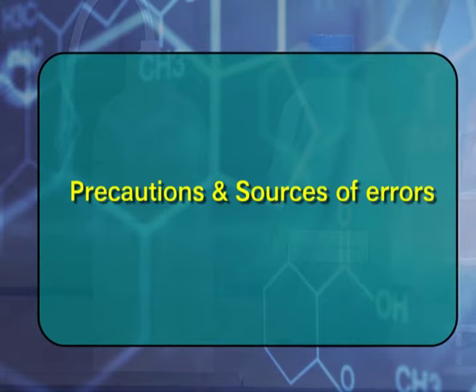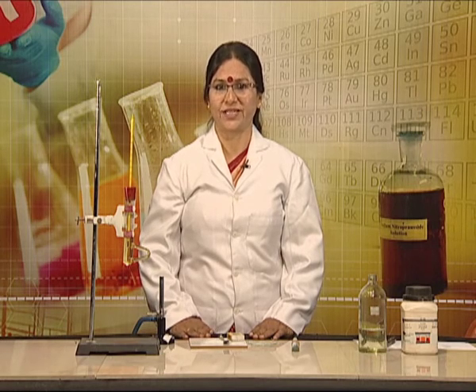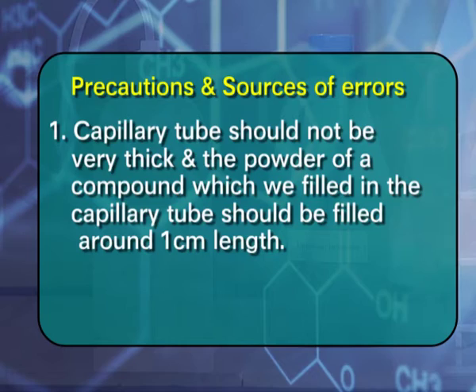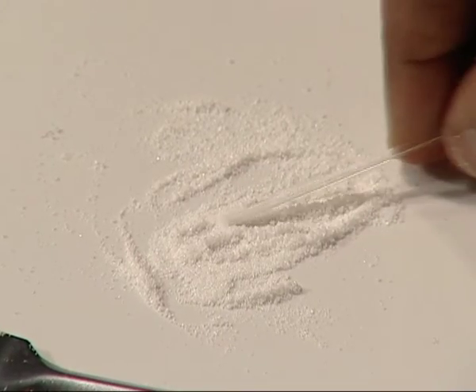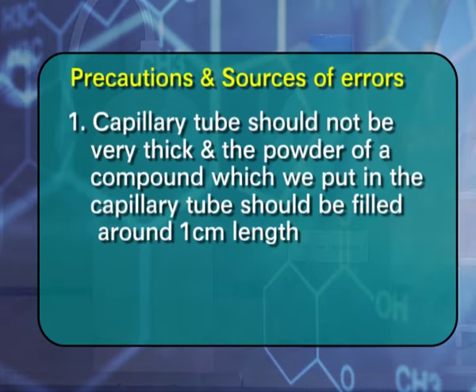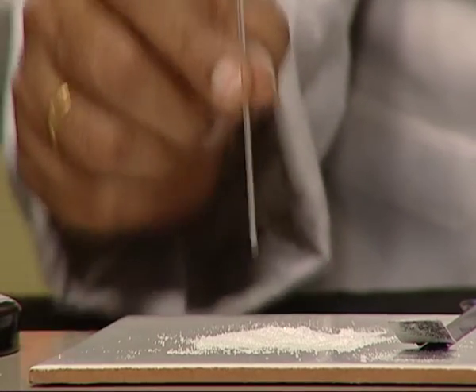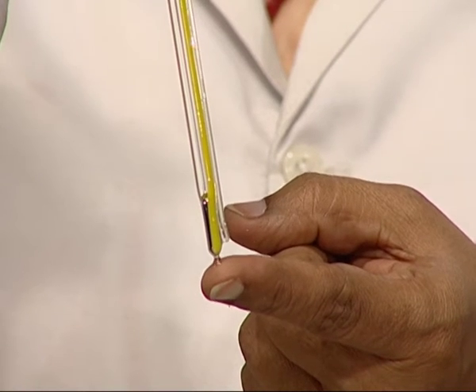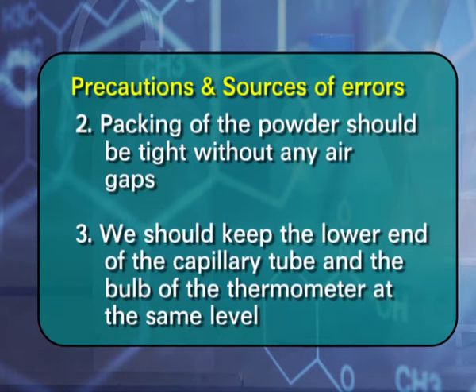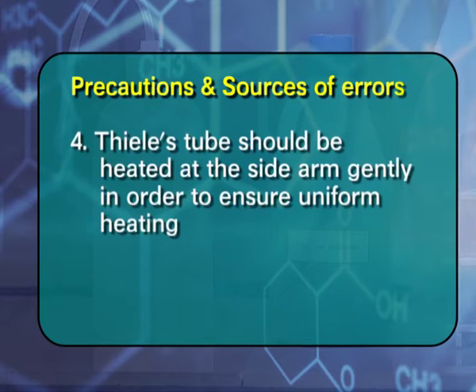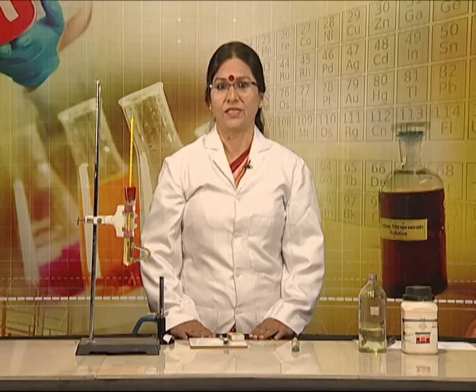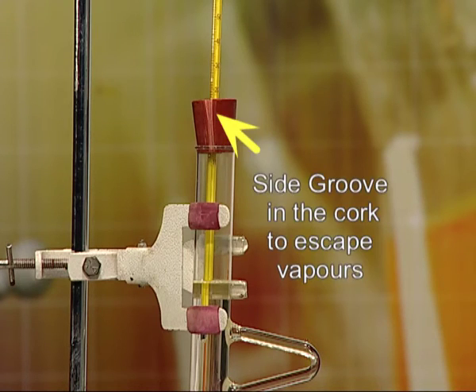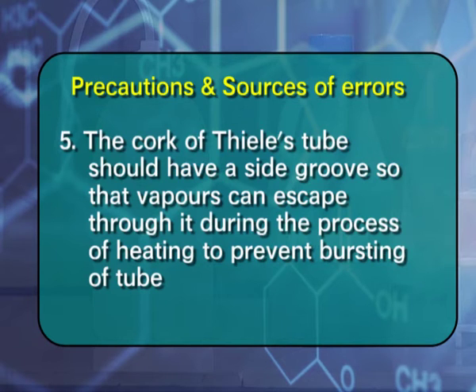Some precautions and sources of error to keep in mind: the capillary tube should not be very thick, and the powder filled in the capillary tube should be about 1 cm in length. Packing of the powder should be tight without any air gaps. The lower end of the capillary tube and the bulb of the thermometer should be at the same level. The bend of Thiel's tube should be heated gently for uniform heating. The cork should have a side groove so vapors can escape to prevent bursting. Safety gloves should be used as heating is involved.